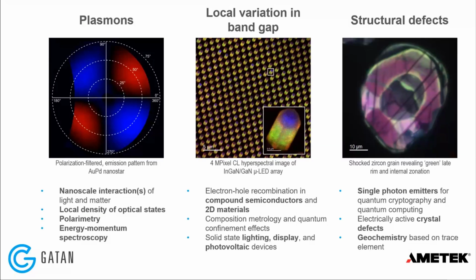And then if we look at ultra-wide bandgap materials, getting towards 6, 7, 8, maybe even up to 10 eV, then we are starting no longer to look at the bandgap information at the optical frequencies that we can detect in CL, but rather structural defects, so things which put electronic states into the forbidden bandgap of the material.